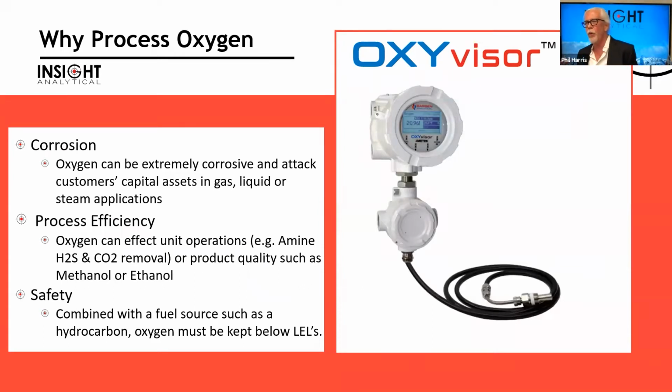So first of all, we want to understand why we often want to measure oxygen. When we look at the big three measurements that probably get done in industry, the big three are probably water, CO2, and oxygen. Probably the three most common things that get measured. And in oxygen, we measure for a number of different reasons.